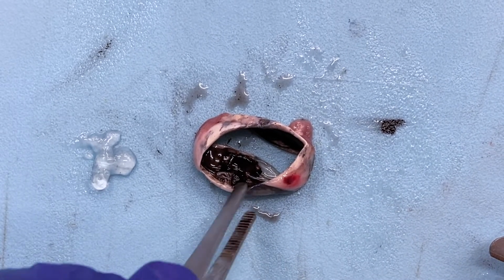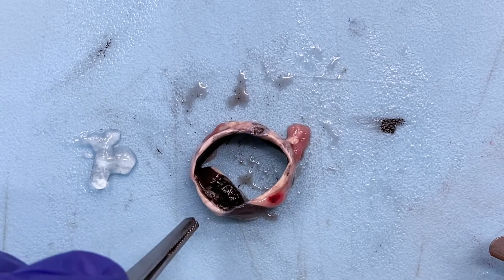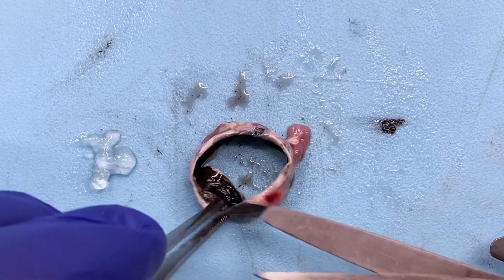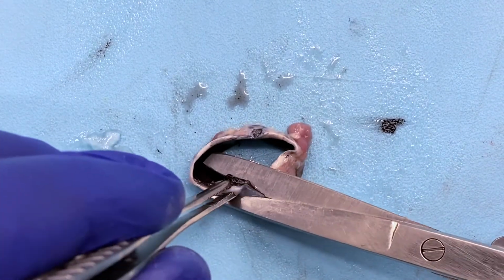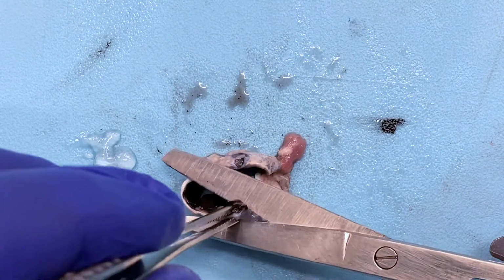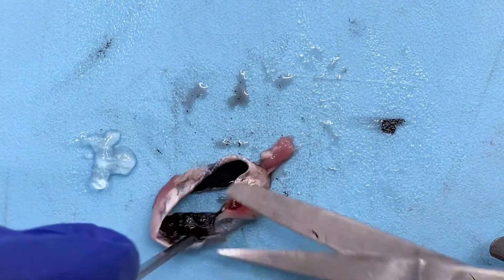So one thing I'm going to do for this, that a lot of people don't initially think is okay, but it's something you can absolutely do with your sections, is start trimming them up. So I'll take some scissors around.